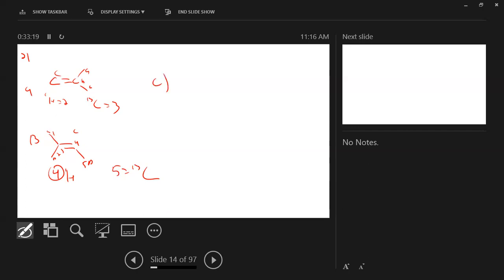Now working over to C. Our different proton signals are here. 1. This will be the same for proton. And then for carbon, so for proton NMR, you have 2. Carbon-13. Let me see. These are equivalent. These are equivalent. So you have 2. D. This.